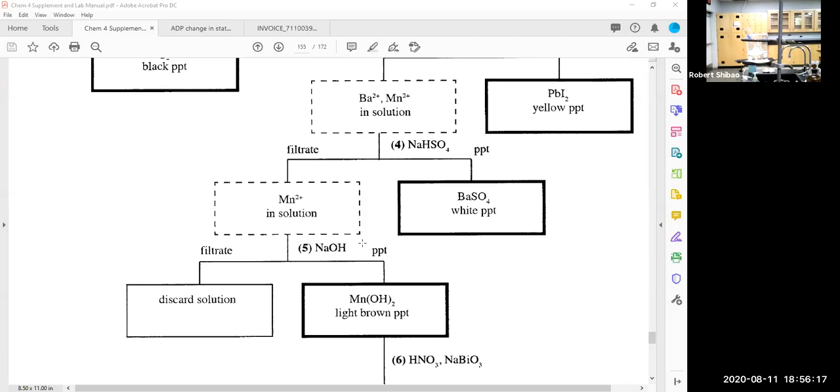Okay, how about this one? Let's take a look. Hopefully this one has some more. So this one's been cooking for a while, and we still have some white precipitate in there. Let's see if that precipitate dissolves. Precipitate should dissolve if it's lead. But then again, lead chloride is insoluble.